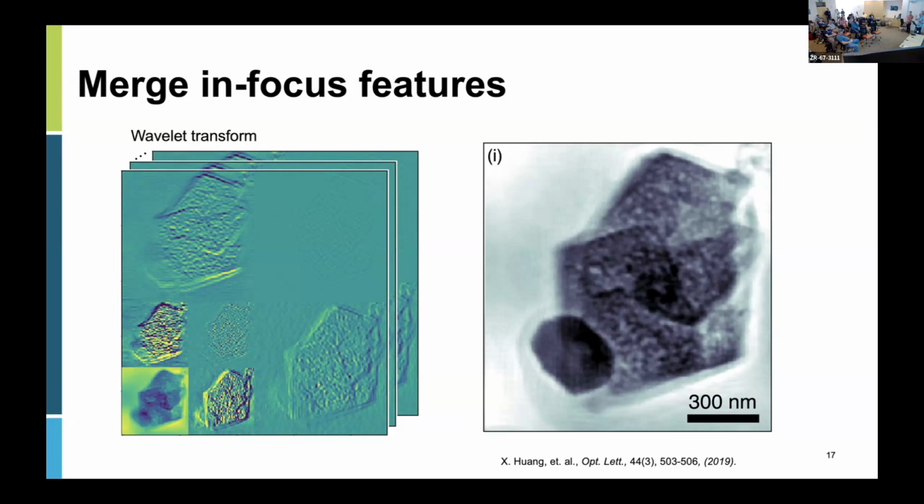And there's one that works specifically better than the others. I forgot the name. It's like complex value something. It's been a while, so I don't remember. So yeah, you are right. How to do this wavelet transform makes a difference, and we explored the available methods and found one of them works the best.